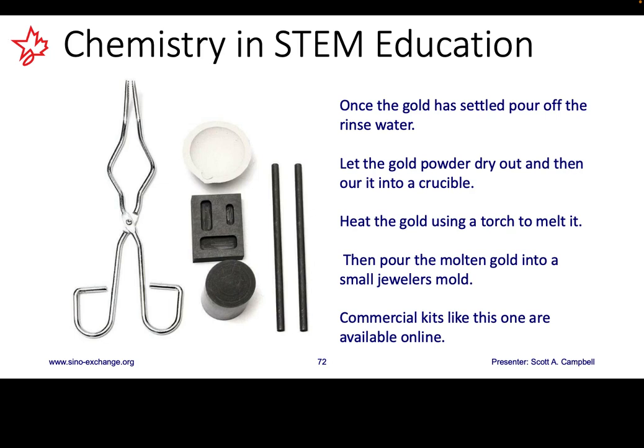Vacuum filter the solution and be sure to rinse your beaker, funnel, and paper with water, as they'll contain gold. The lead precipitate will be stuck in the filter. Then add sodium metabisulfite to precipitate the gold out of solution. Then conduct another stannous chloride test to ensure that there's no gold left before discarding the waste solution. Then rinse the gold powder with hot water again.